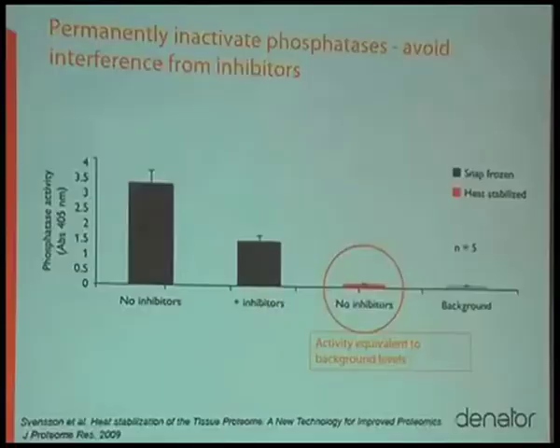If we compare that to the activity level that we detect in the heat-stabilized samples, we see that level is really at the background level, so very low to background level activity detected after heat stabilizing of these samples.